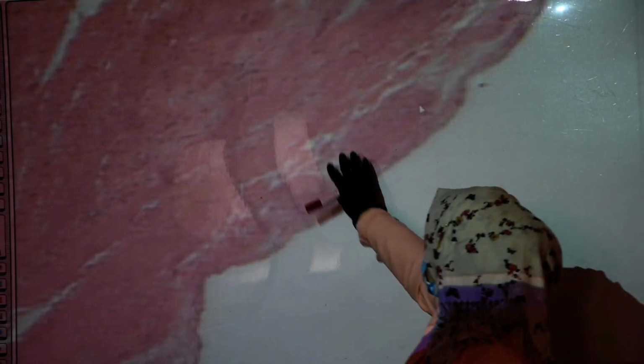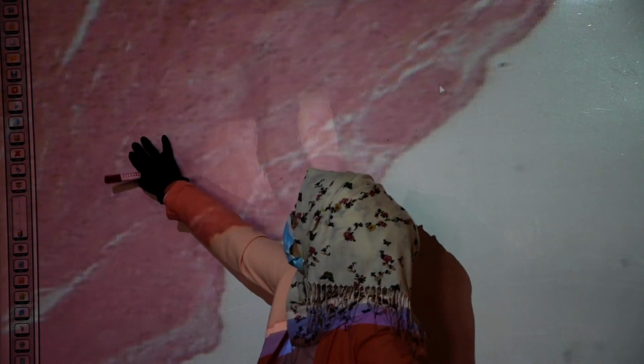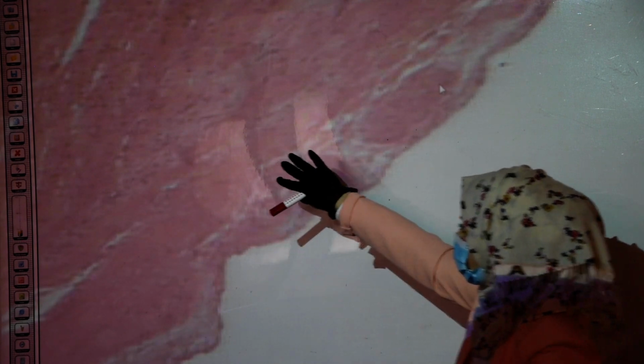Okay. At this slide also, these are Purkinje fibers at the subendocardium. These are endocardium, endothelial layer, simple squamous. Okay, and these are Purkinje fibers. All these are the myocardium, striated cardiac muscle. Okay, and from the outside it's containing adipose tissue, looks like a large layer of cardiac muscle, and these are the epicardium, adipose tissue.